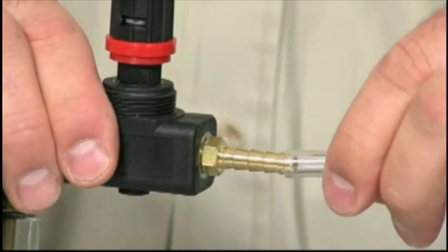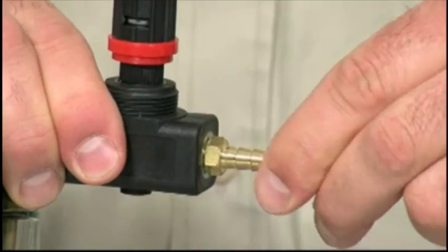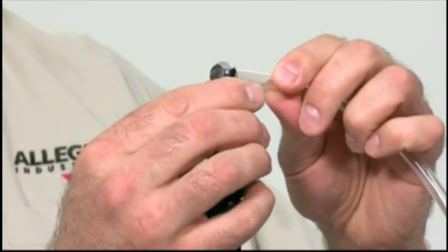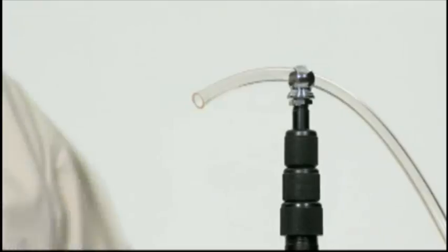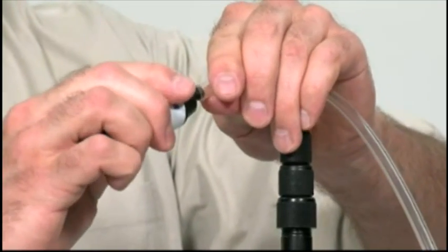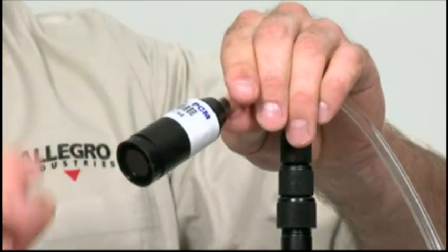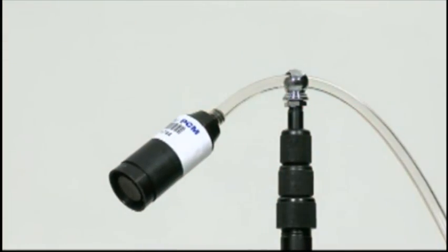Simply attach five feet of tubing to the inlet of the regulator, then thread the opposite end of the tube through a stand. A cassette is attached to the tube and you're ready to draw samples. Asbestos, lead, mold and toxic dust are a few of the samples that can be drawn using the Allegro Rotary Vane Pump.